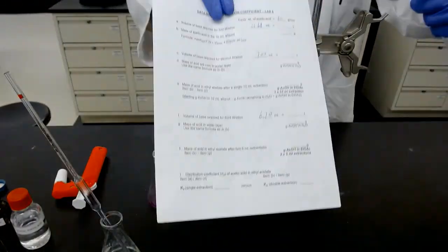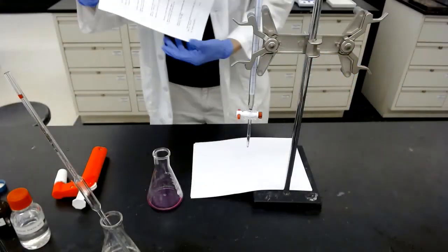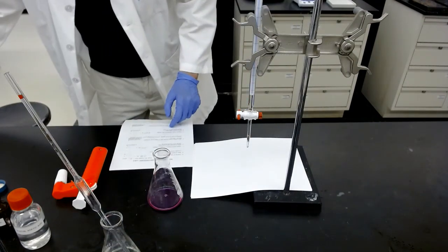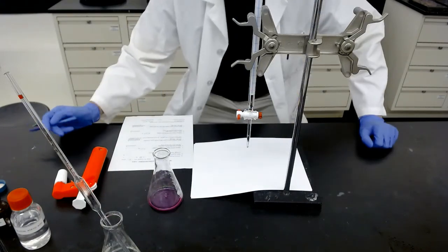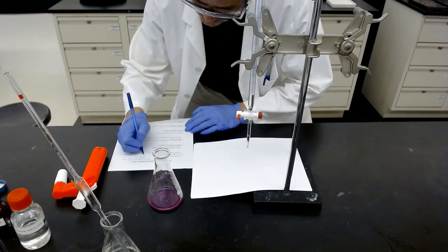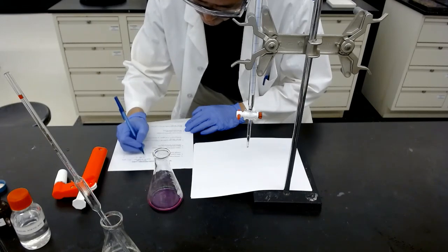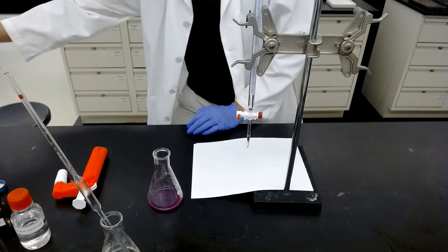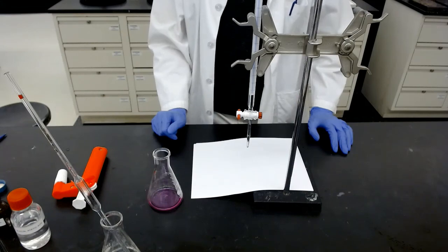On the first one, which is, where is it? Right here, right? The volume of the sodium hydroxide for the first titration. So you need to read the burette. See, the reading 10.10, 10.10 ml. All right, that finishes step number 2.